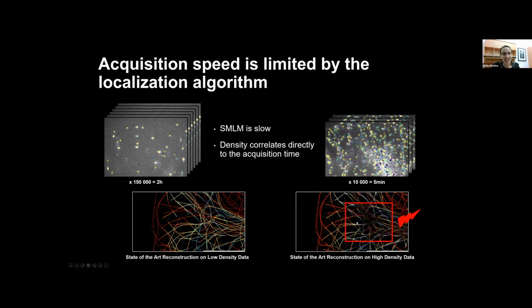That will particularly be seen at places which are very dense. The denser the place, the higher the likelihood, if you compromise in time, that you have two or multiple fluorophores on at the same time. And these, under normal conditions, with normal algorithms, would just be disregarded.